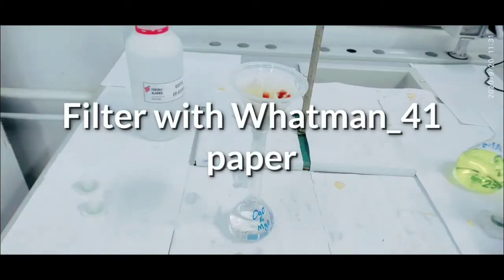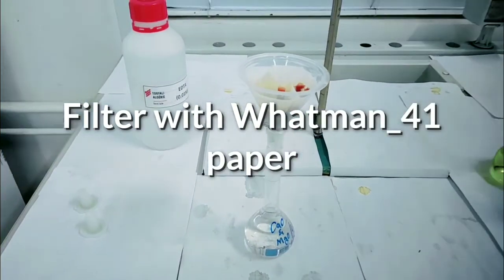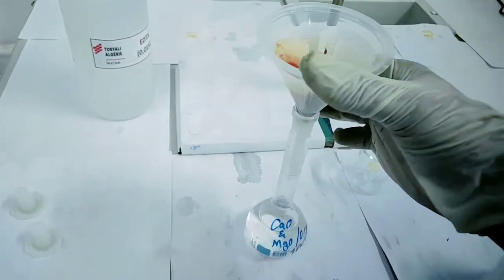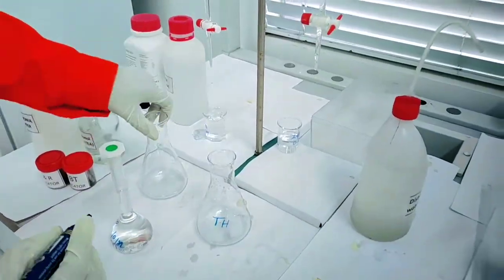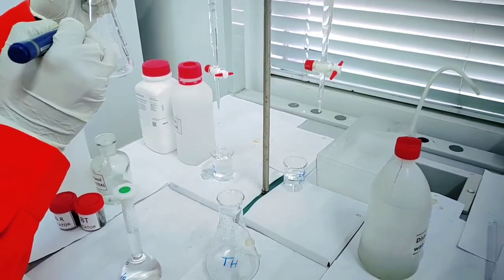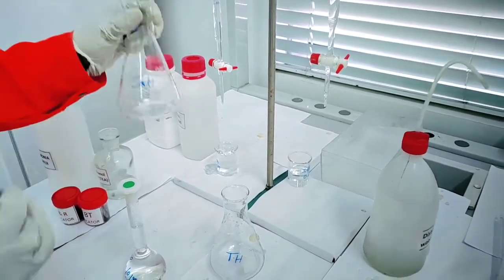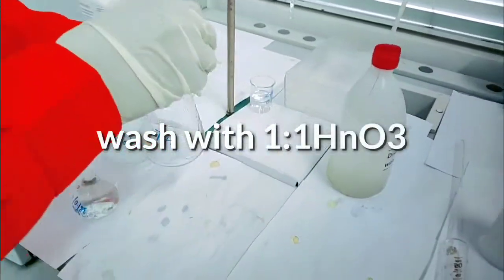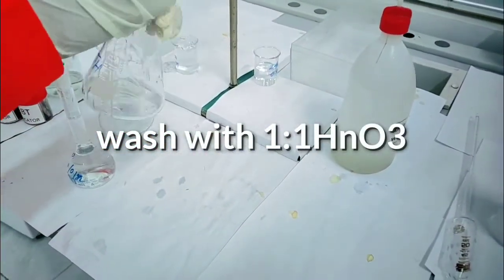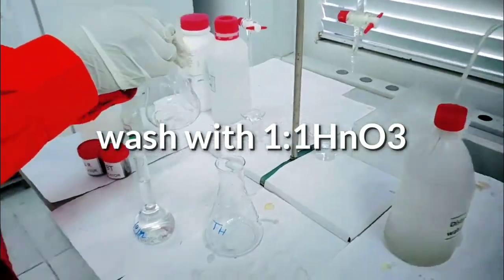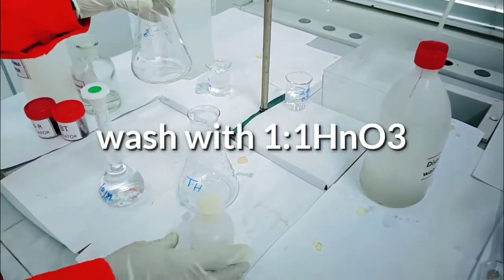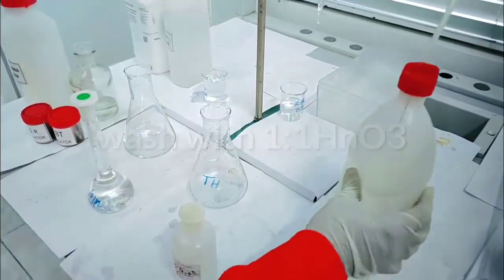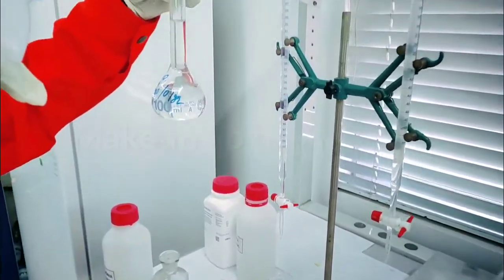Use a star folded Whatman 41 filter paper. Take two clean conical flasks, wash with one-to-one nitric acid, and make up to the mark.